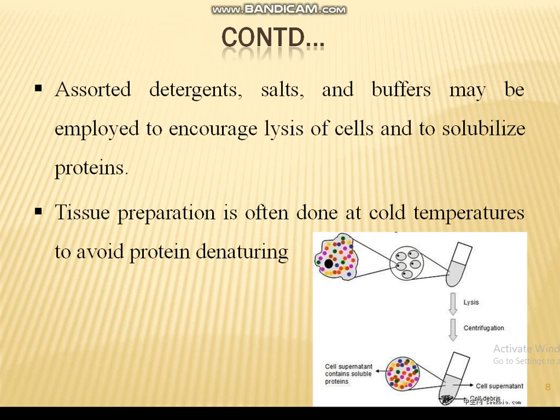Assorted detergents, salts, and buffers may be employed to encourage lysis of cells and to solubilize proteins. Tissue preparation is often done at cold temperature to avoid protein denaturation.